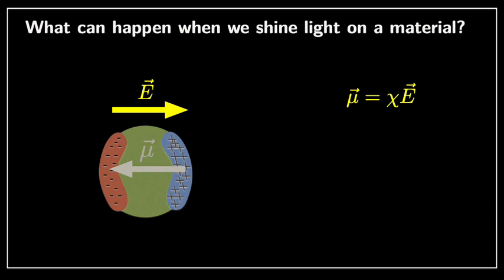So we have on the left the dipole moment, and on the right we have the electric field, and the proportionality value here, chi, is called the polarizability tensor. I like to insist on tensor, of course, when we look at this in very fundamental courses, maybe in a first year course or something like that. We usually use that as a scalar.